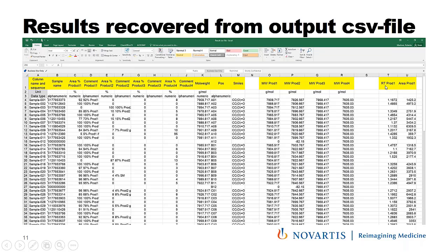You can also choose to display more than just the first one. And on the last column here, you have also the area of the same product. All this data is automatically generated, which makes it very reproducible, nearly free of human error, and is delivered in a machine learnable format. But as said, this is just an example of how it can look like.